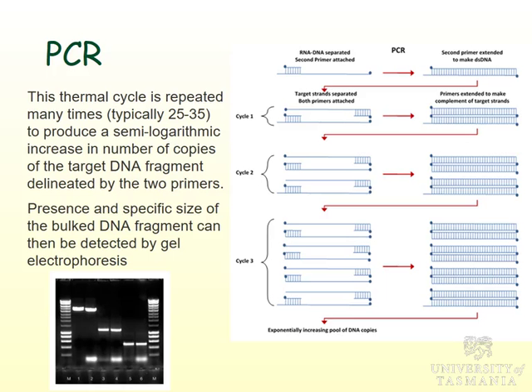So from a diagnostic perspective, this is very, very sensitive. You get a logarithmic production of this, very, very high sensitivity, and quite specific because it's based on that DNA homology between the primers. Not only the homology of the primers, the fact they can bind, but also how close they are to each other, and you can specify that.